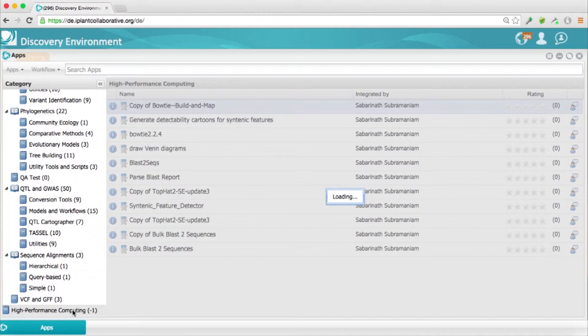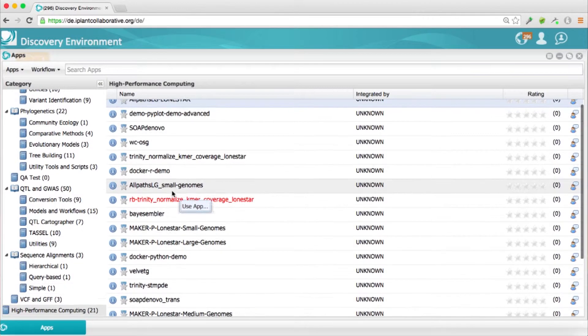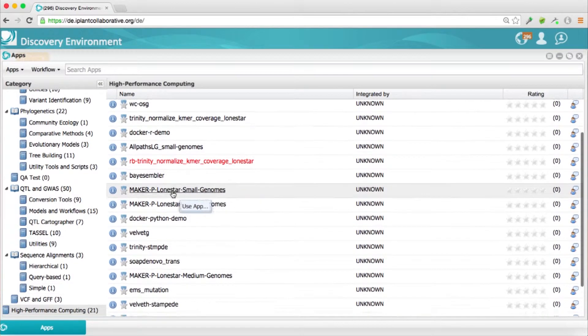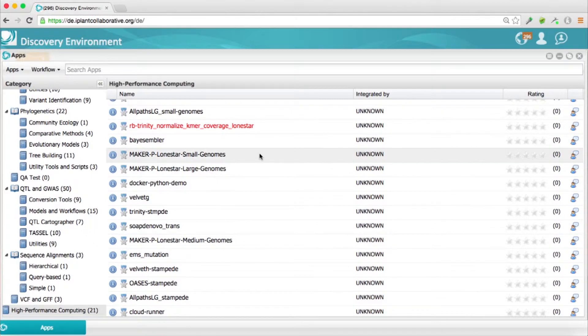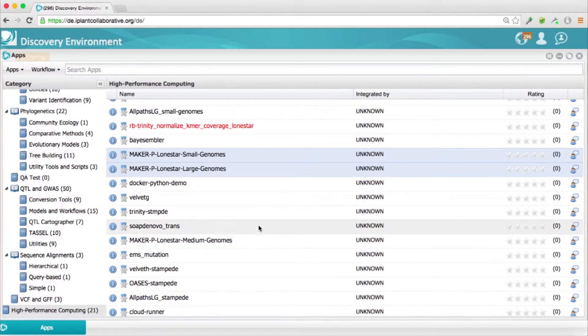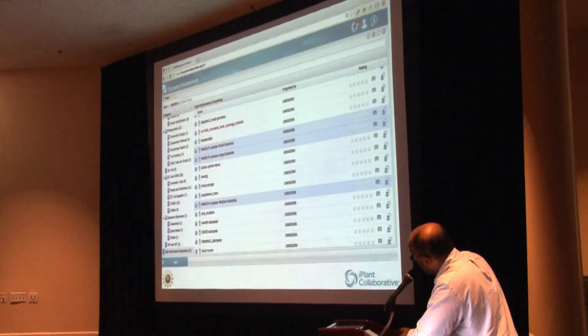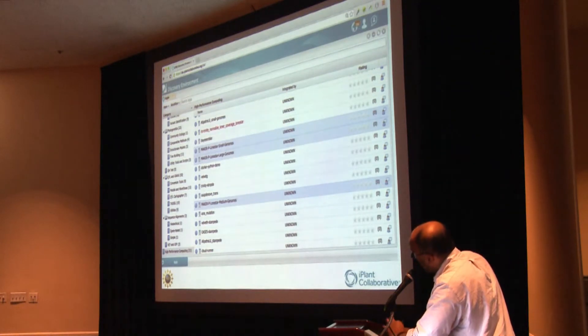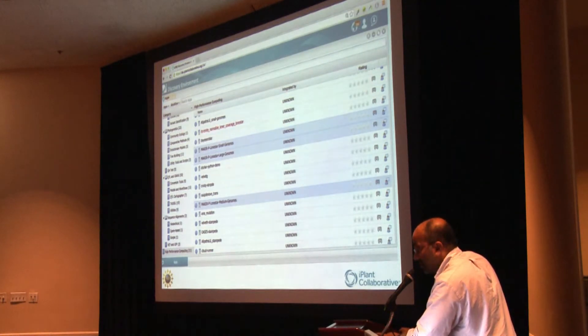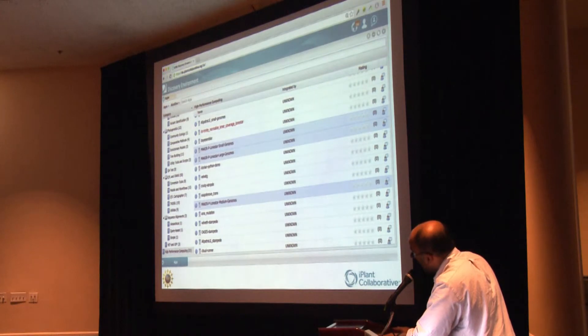So as far as MAKER-P is concerned, this particular instance is going to be running on HPC on the TACC server. So those apps that have been integrated to run on HPC are right at the bottom of that list. And so what I've highlighted here are three flavors, essentially, or three versions, three variations of MAKER-P on Discovery Environment.